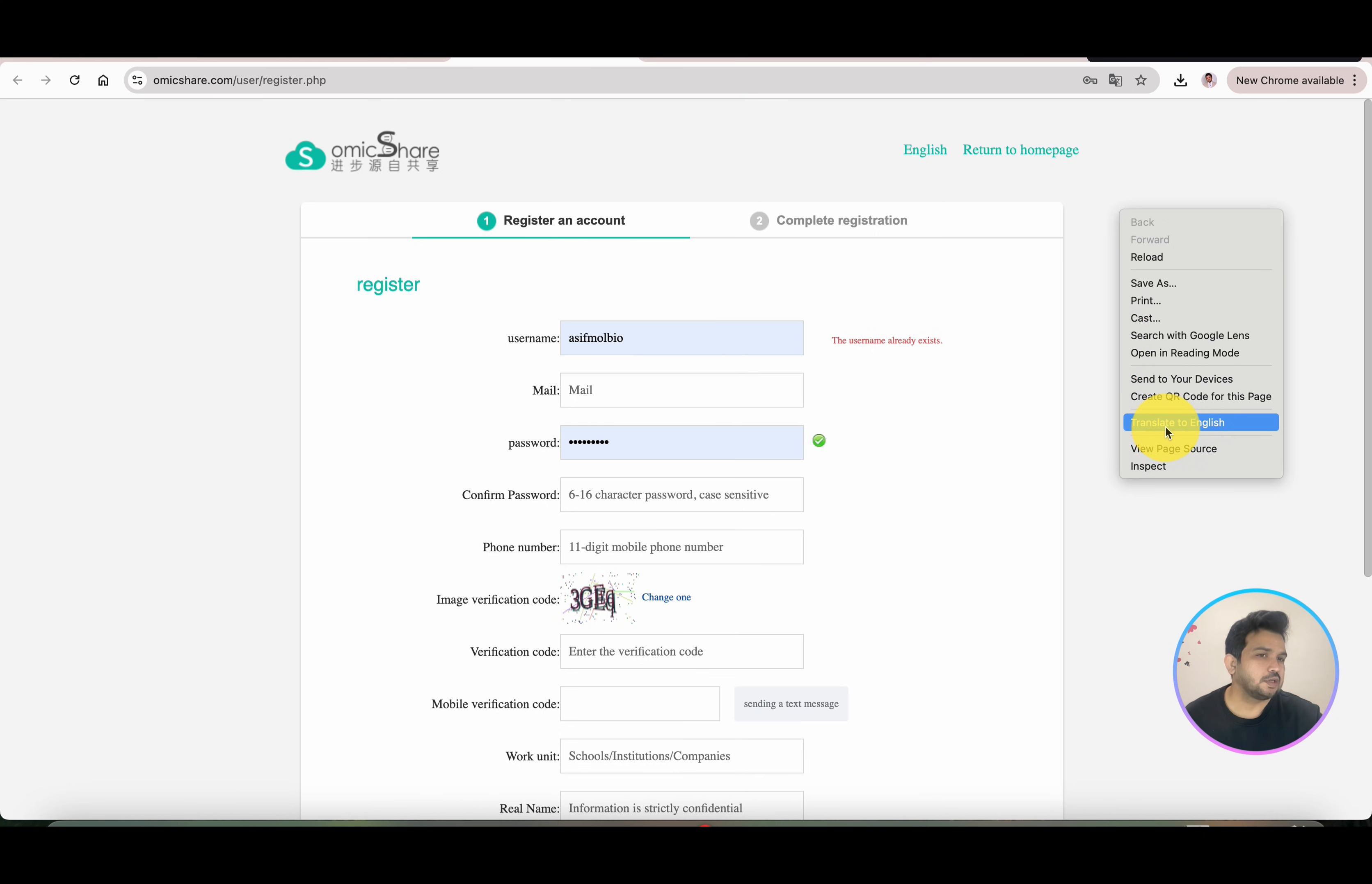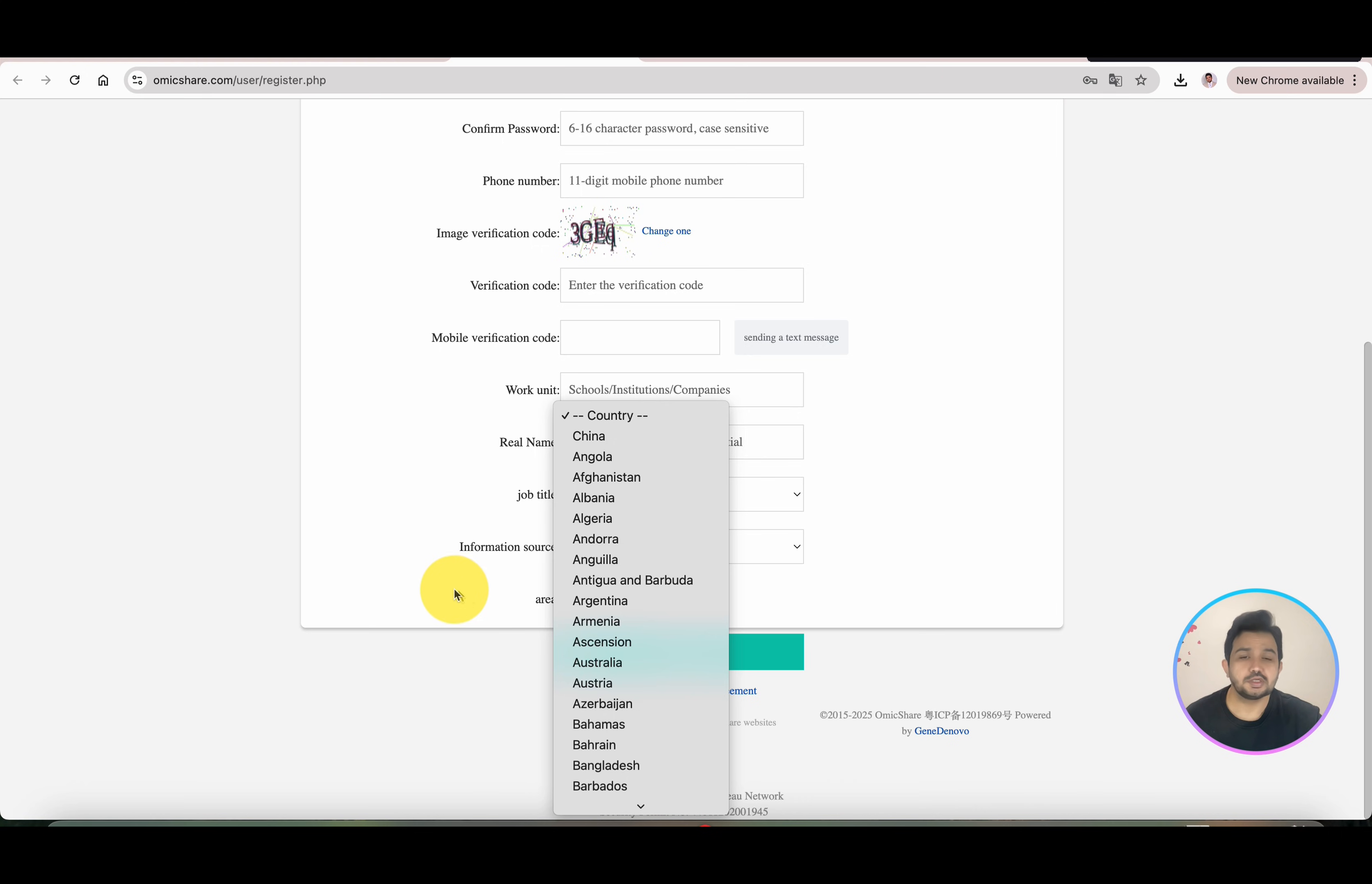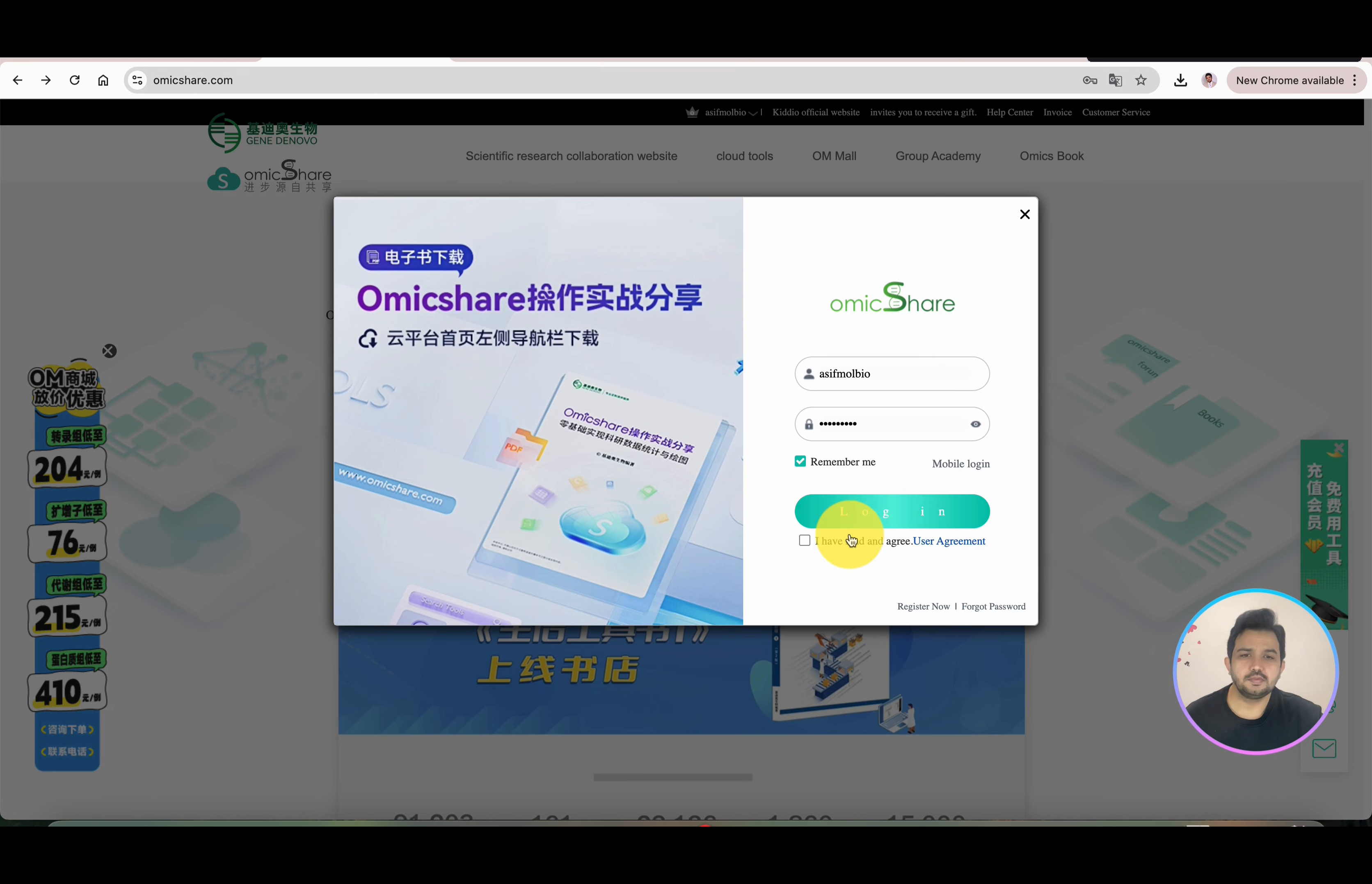Like all other databases, you need to enter username, email, password, and then your phone number. If you're accessing this website from any other country, you can simply change it to your own country from which you're accessing. After this, you will get an OTP and you can register. I can log in, agree to the terms, and let's log in.